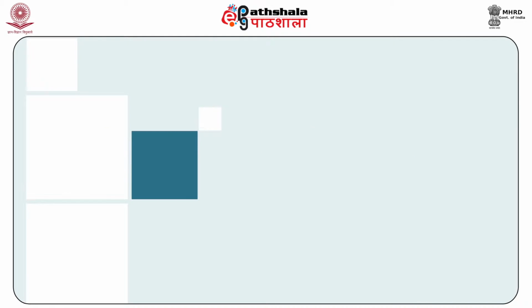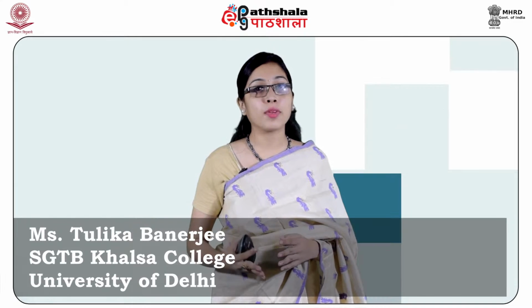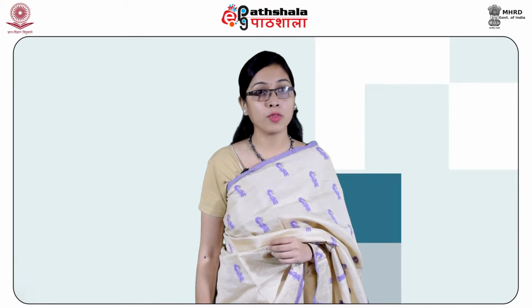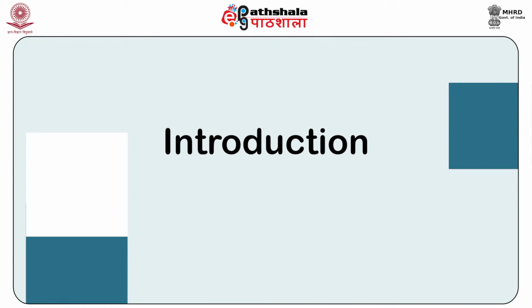Learning outcomes. Dear students, after studying this module, you shall be able to know about the significance of column chromatography, the principle and methodology of column chromatography, and the general aspects of column chromatography. Now, let us start with the introduction of this module.